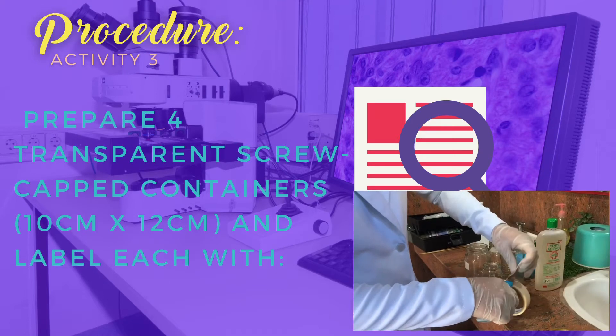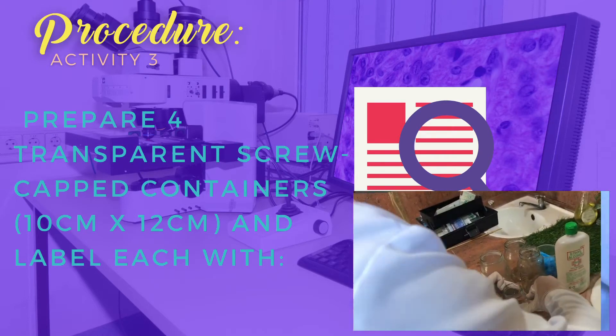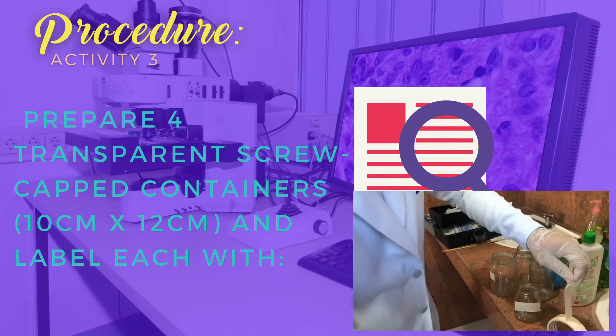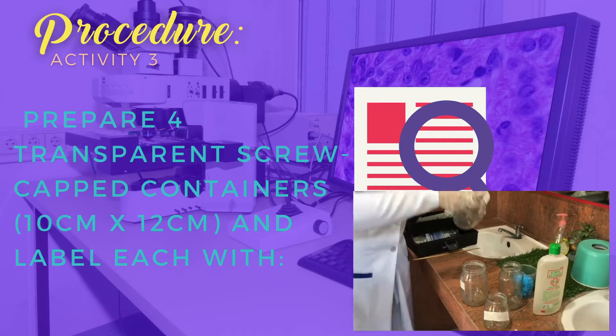Next, prepare 4 transparent screw cup containers, 10cm x 12cm, and label each with container A, B, C, and D.